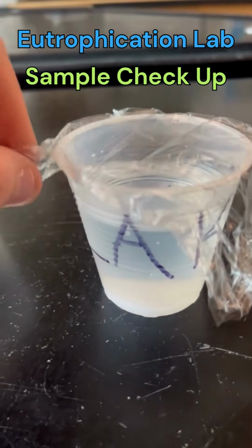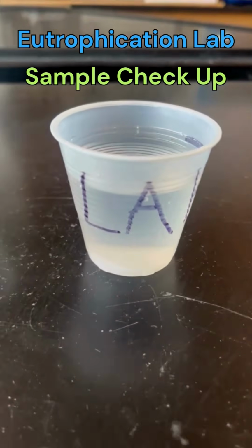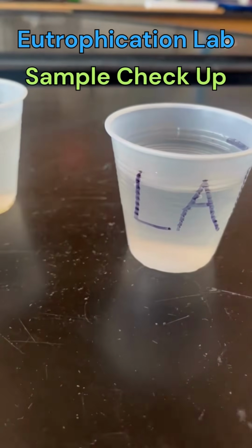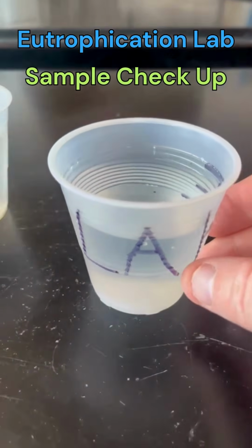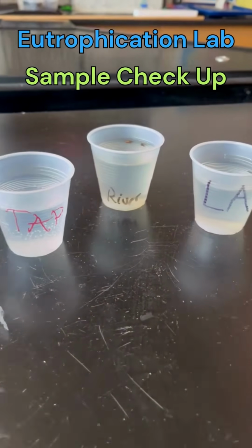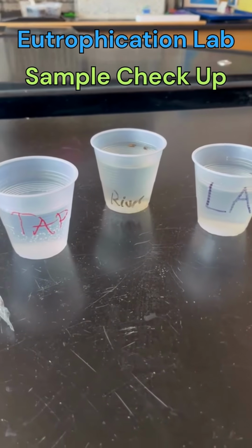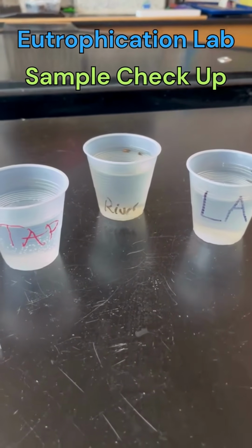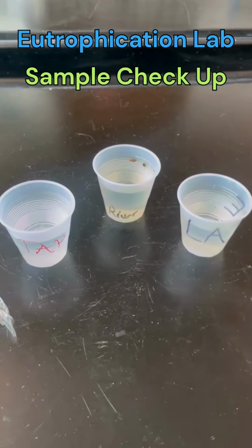The lake, which I thought would be the most eutrophic and had the most change in terms of color, wasn't. So perhaps it was the location of the river water versus lake water, the certain lake, the depth, the time of year I took the samples. So this can add to more analysis and more questions of why the river water, which is generally less eutrophic because it's flowing, versus the lake water, and why these results were occurring.